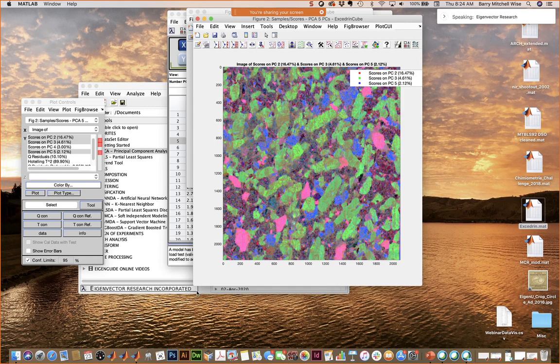It may be that for your own particular problem, it makes sense, for instance, that the trees in it be green and the rocks be red, if you've got an image like that. So how you associate color with a particular feature can change the look and make it more sensible to look at.